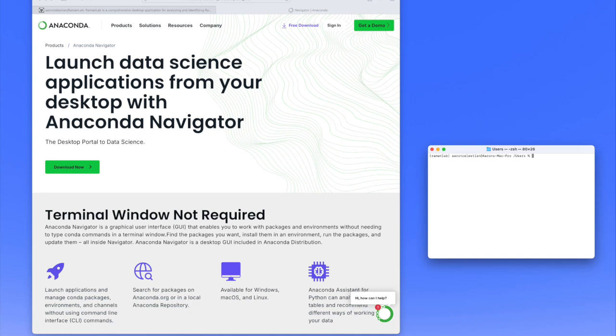So this is where you get it, the Conda Python environment, and you want to go to www.anaconda.com. It's a free download. You may have to give an email address, but it's a very nice environment. This is the one I use, so I strongly suggest it. So go to free download, pick your operating system, your chipset, and go from there. So pause the video while you do that.